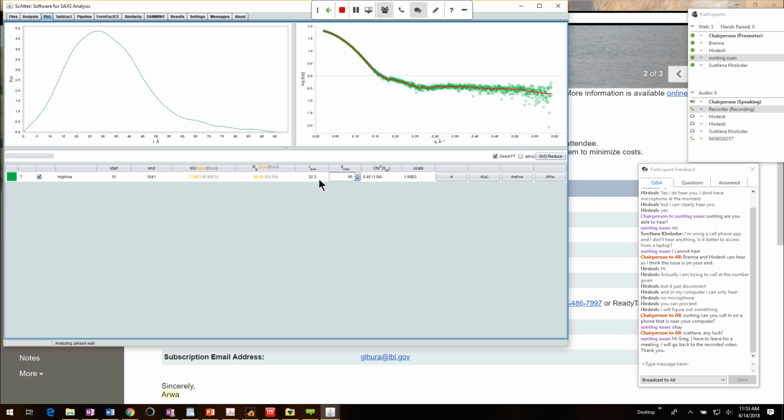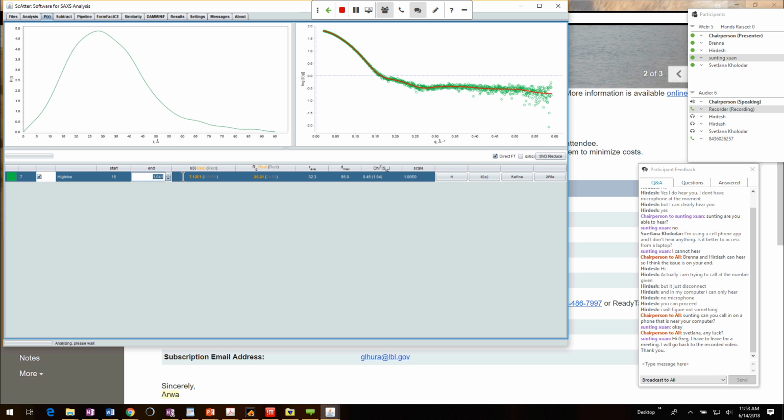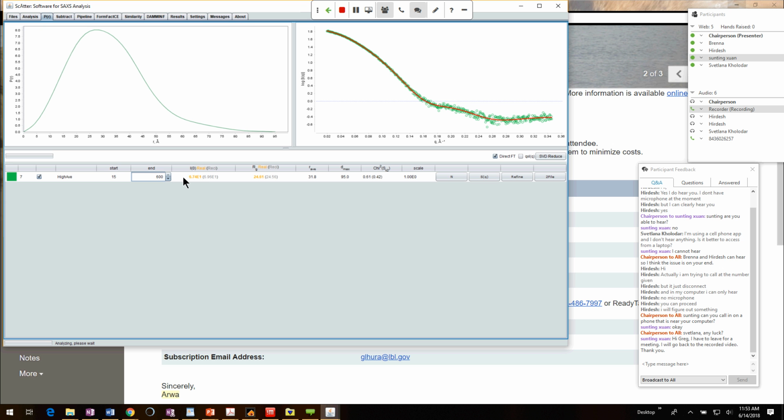You should play around with how many points you use for this process. So to make sure it's consistent, the P of R function is generally only useful when it uses up to Q of 0.35. So I'm just going to do that. I'm going to use 600 points to see how that affects this Dmax. In this case, we're pretty good. I might be able to clip back a little bit, somewhere around 88.5.